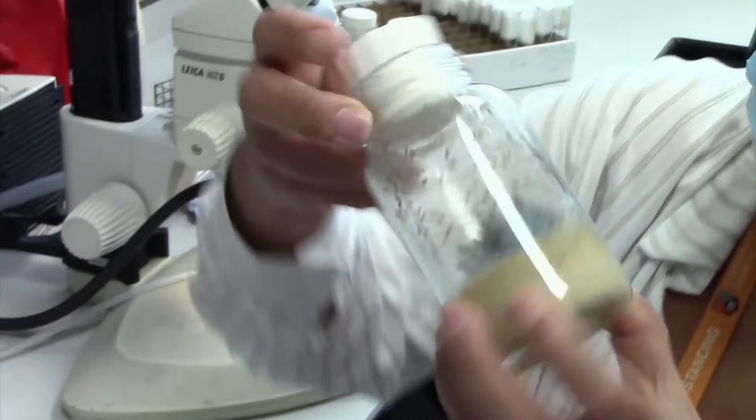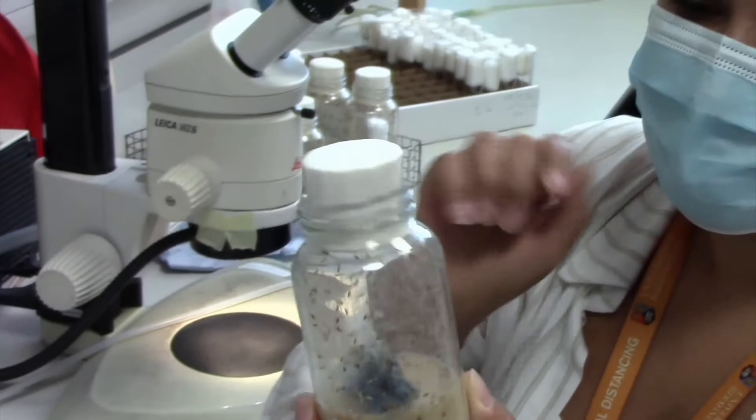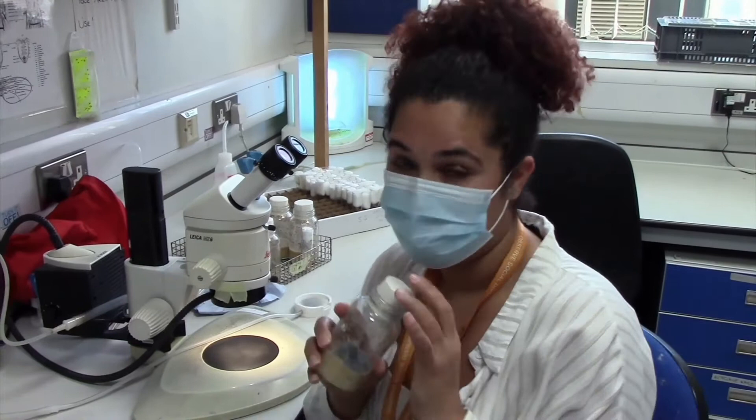These are the bottles that we normally have the flies on. You can see that I have here some flies flying around, some larvae, some pupae, and here is the fly food. They feed on this and then we keep them here so that they are ready for when we need to do our process.